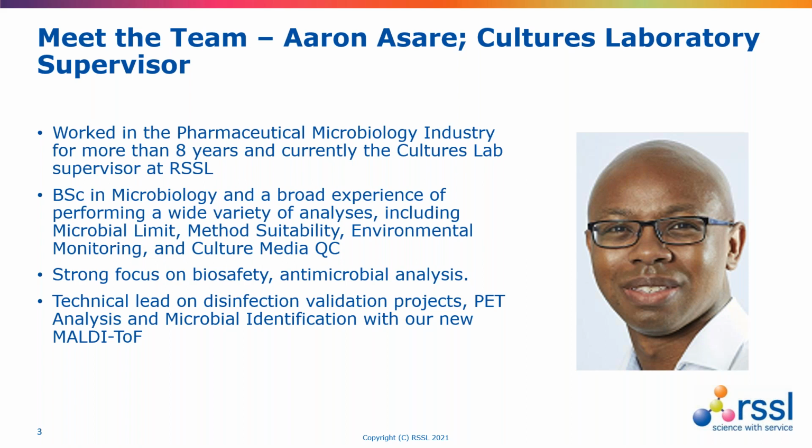For most of our clients, they tend to go the route of having multiple disinfectants, which is usually recommended, multiple of each different type: multiple sporicides, multiple general purpose disinfectants, usually at least one alcohol. And generally, from the point of view of the sporicides, that can get quite complicated because trying to find a sporicide which is not only effective but also well tolerated by the staff is quite important, from a health and safety point of view, and also so that it doesn't damage your surfaces, which can be quite difficult.